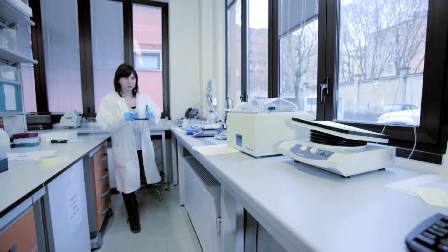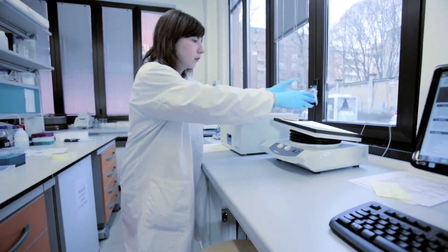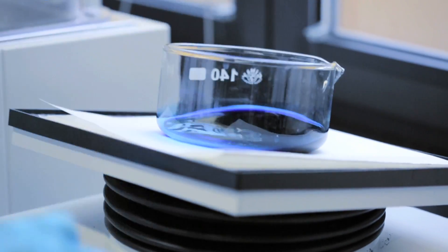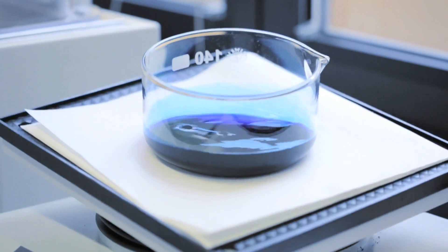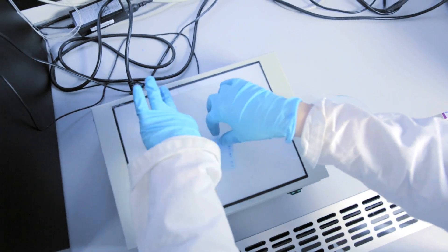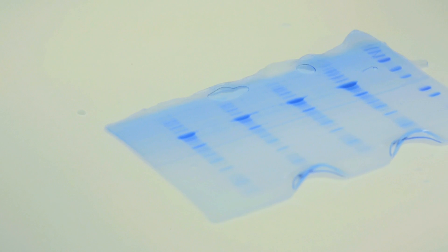In the SDS gel, you can see many blue lines that correspond to proteins that are constitutively expressed in bacteria. The bigger blue band corresponds to the protein of interest, and you can see that this pattern of proteins corresponds to our sonicated extract.